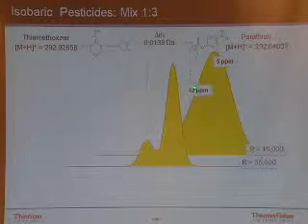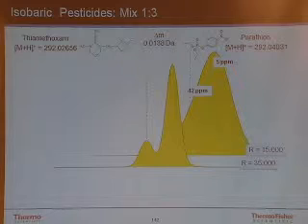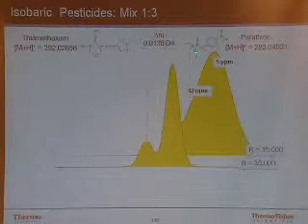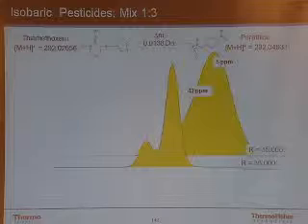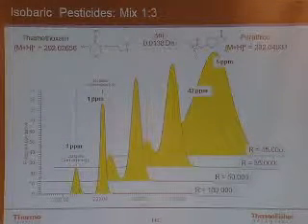If you measure it on the front side of the peak where this red line is, now you've got a true mixture of the 2 pesticides, and now the mass measurement error in the parathion is 42 parts per million. That's absolutely useless.